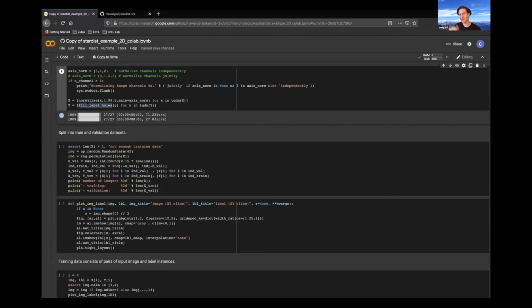But that's actually a super important point, because otherwise with background patches, if you just have noise and you normalize noise, everything will be popped up. It will still be fine. It won't make mistakes there. But later on, it might be a problematic part. If you normalize your whole image, the background would be normalized differently, right? So it might be good in these conditions to normalize using larger areas and then use small patches just for the analysis, let's say. Exactly. Like that. Okay. Cool. Okay.